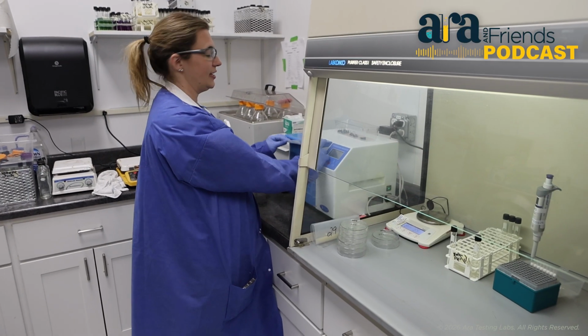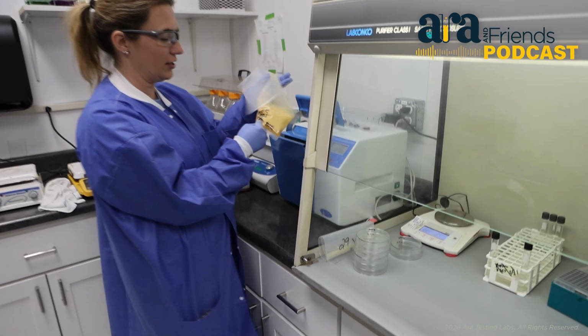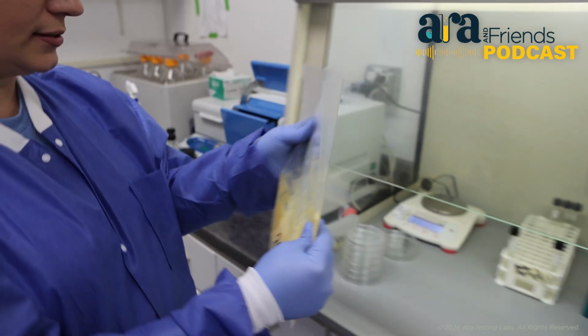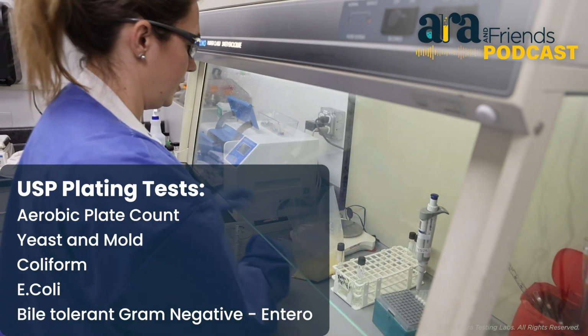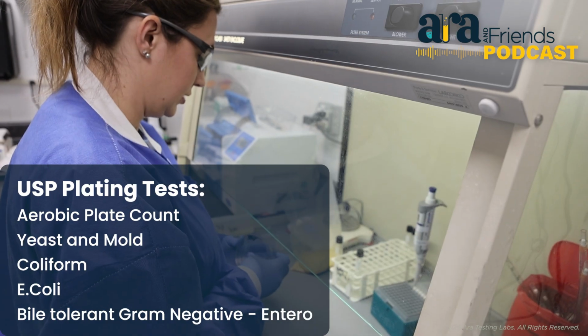Okay, so now we're taking our sample out of the stomacher, making sure it's all homogenized, all the capsules are broken open and emptied out, which it looks good. Then we'll make our dilutions and put them to the appropriate petri dishes.